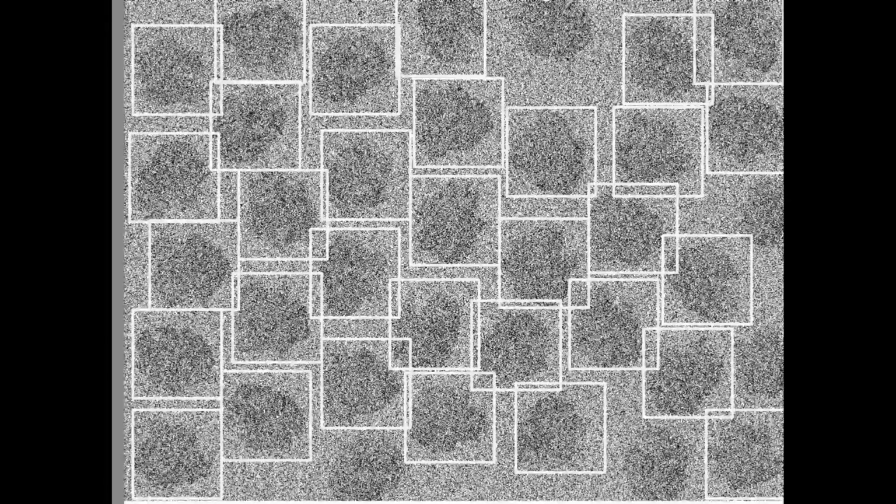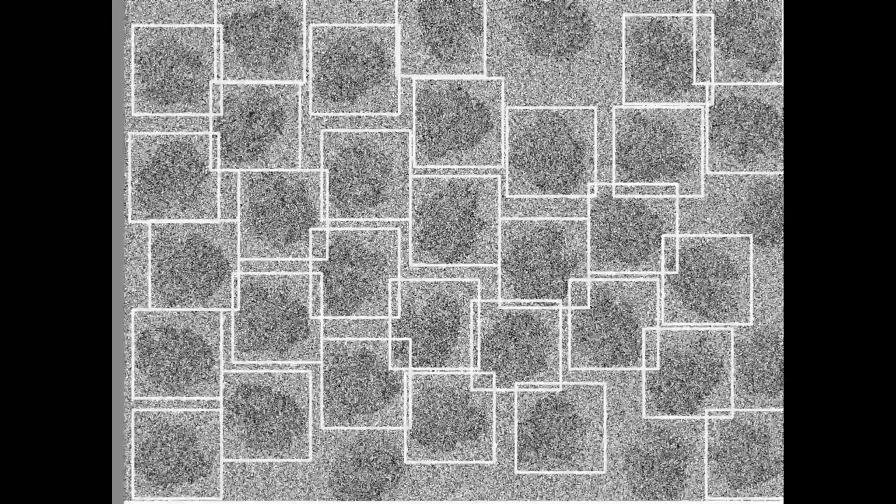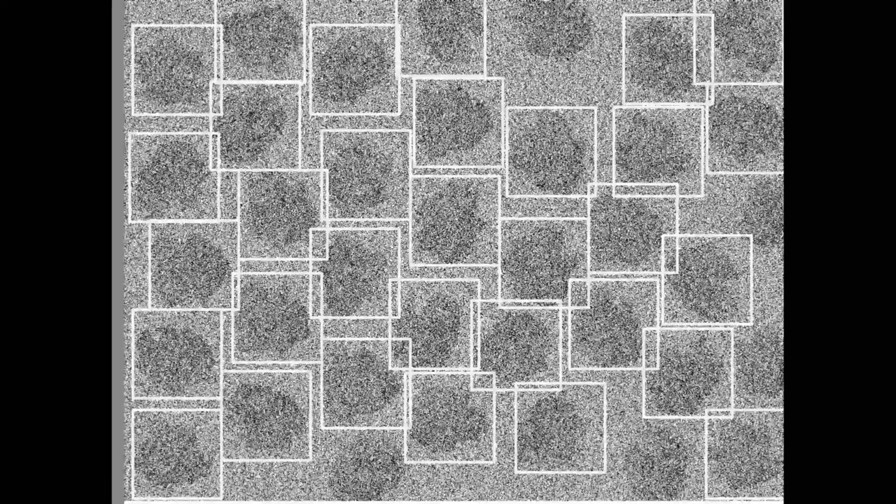So then we have to have some kind of a search program that finds the individual molecules, and then we put them into separate files. The previous one was a simulation, but these are actual images that have been obtained by this process. So these are ribosome images.